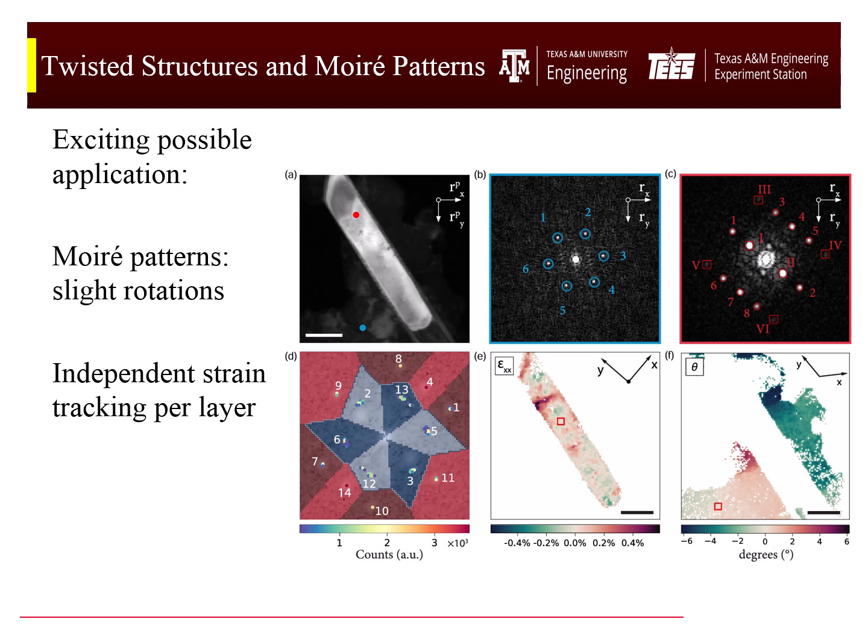In the molybdenum oxide and molybdenum disulfide heterostructure case, despite the low image contrast, EWPC combined with difference of Gaussian filtering successfully isolated distinct peak clusters for each material. The resulting strain map shows that the molybdenum oxide nanorod experienced tensile stress, while the molybdenum disulfide shell primarily underwent rigid body rotation. This detailed multi-material mapping would have been extremely challenging using traditional methods.